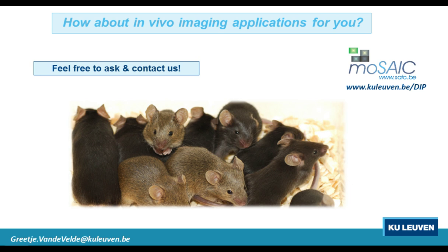So hi again, and let's start with the Q&A session. So, Dr. Vande Velde, the first question would be, what was the resolution used to scan the skulls? We use scans at 50 micron isotropic resolution, and that already gives us very good results that enable us to do all the analyses as I showed here.